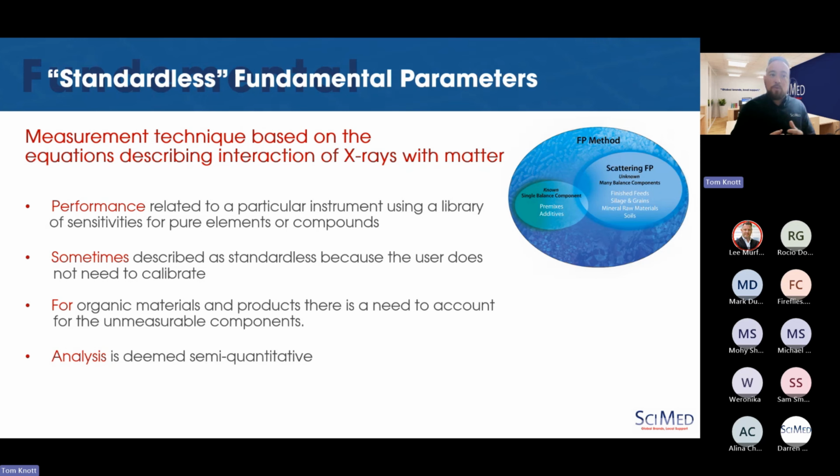In some circles, this would be described as a standardless approach, which strictly speaking it is, because you don't immediately need known standards. That has an advantage, but I know for many analytical scientists it almost becomes a bit of a dirty word: if you're running it without standards, it's just a look-see, it's just qualitative. I would argue more that it's semi-quantitative and approaching quantitative with the addition of some matching library reference matrix samples, which is where this becomes increasingly powerful.